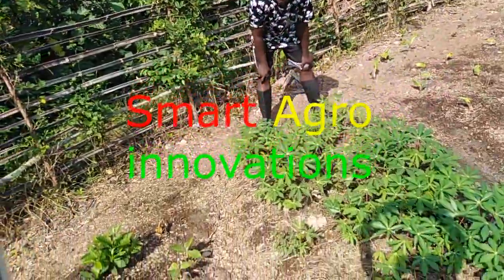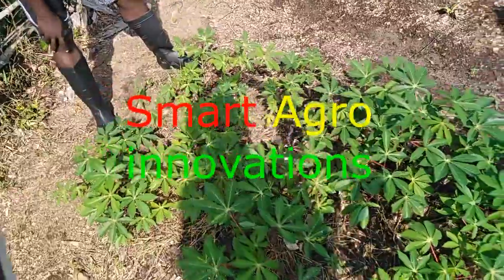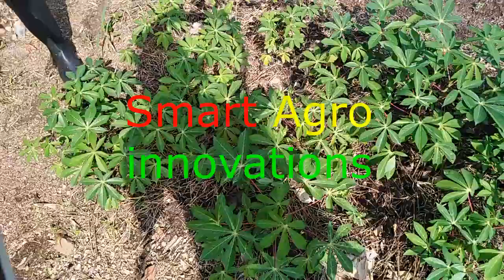This is another super amazing seedlings of cassava. What you see here, they are ready for transplanting. They look so nice and healthy.